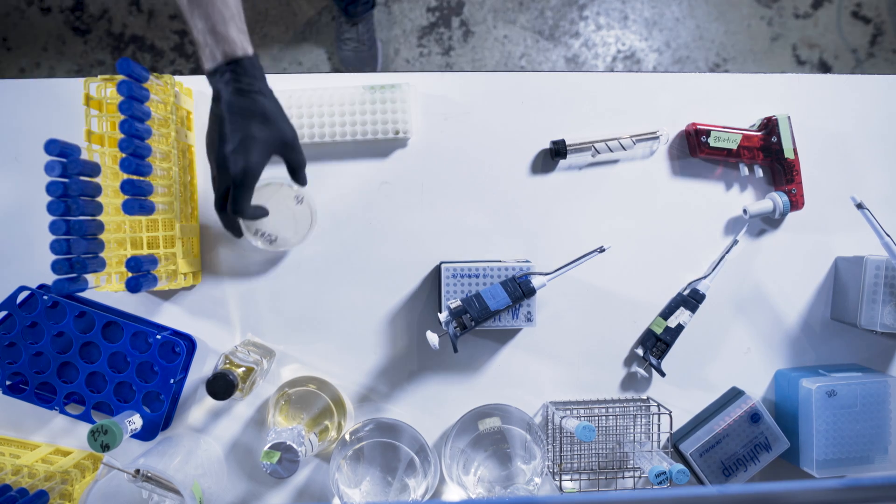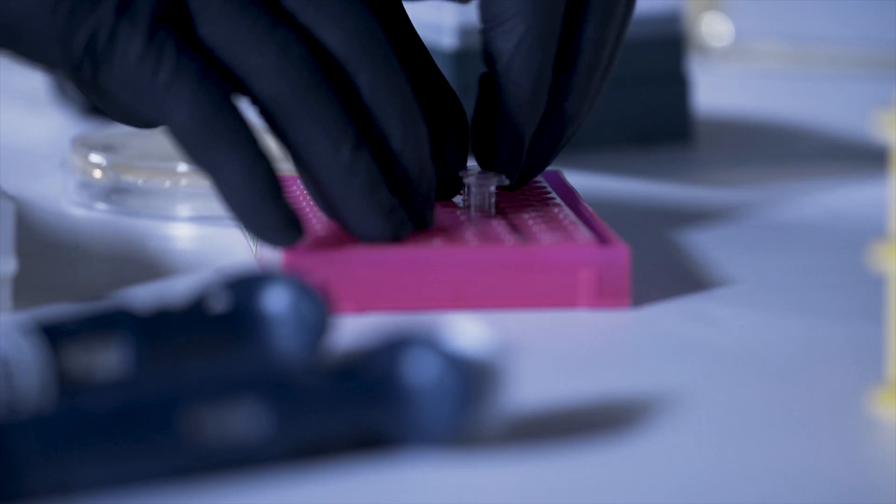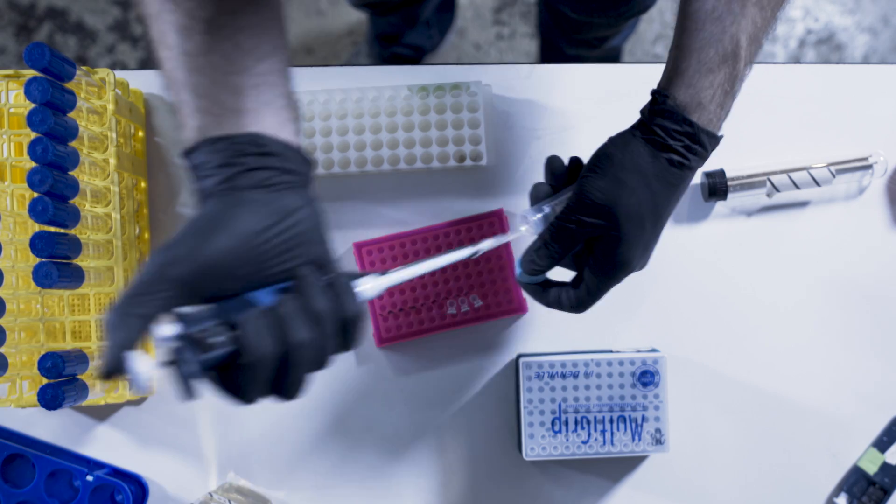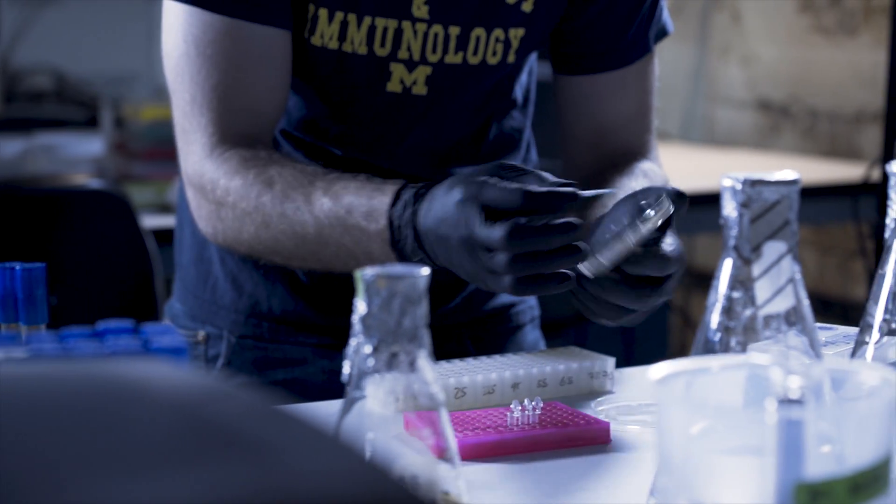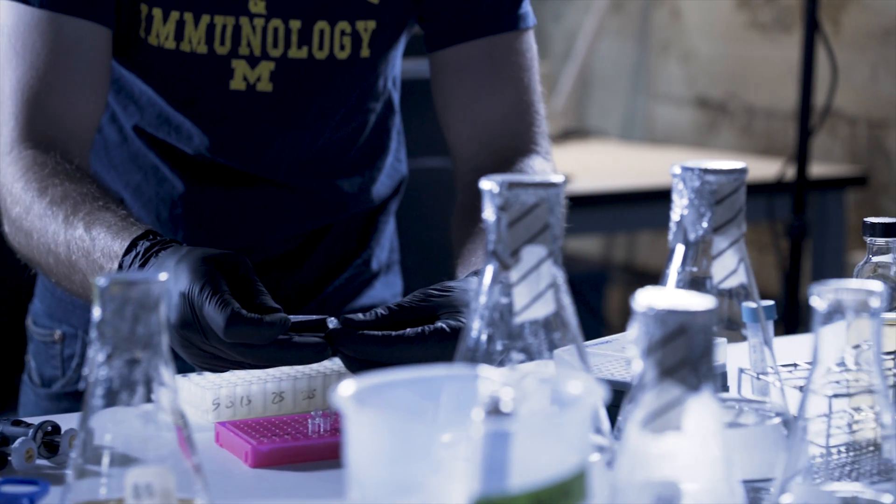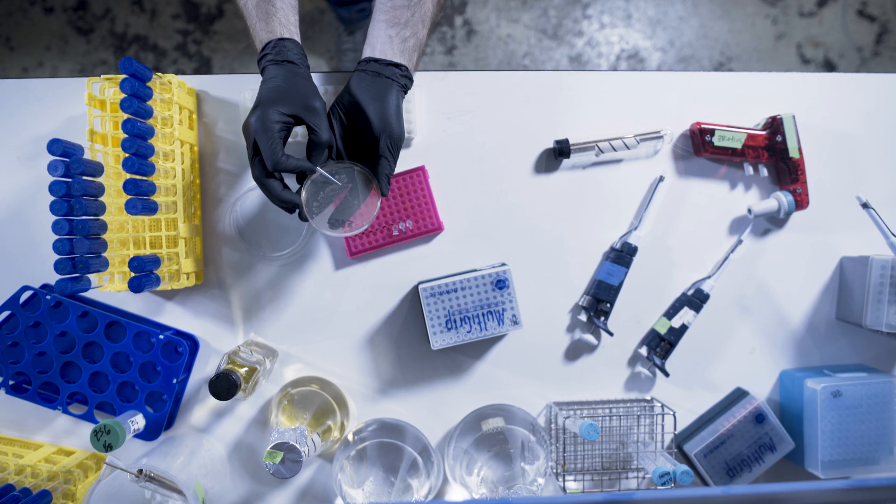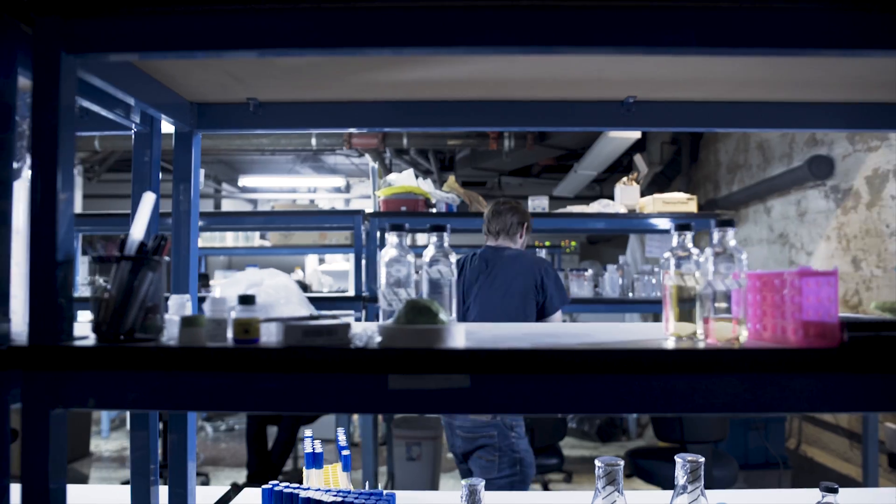However, sometimes weird stuff happens, so we always verify our clones using diagnostic PCR or by sequencing. Basically, we'll take a few colonies and sequence a short portion of their DNA where we expect the modification to take place. We can then read this sequence and verify that what we wanted to happen actually took place.